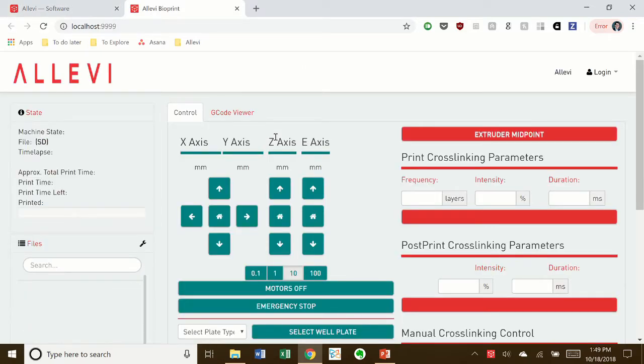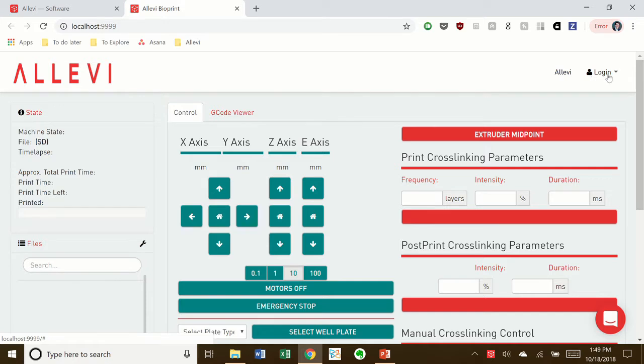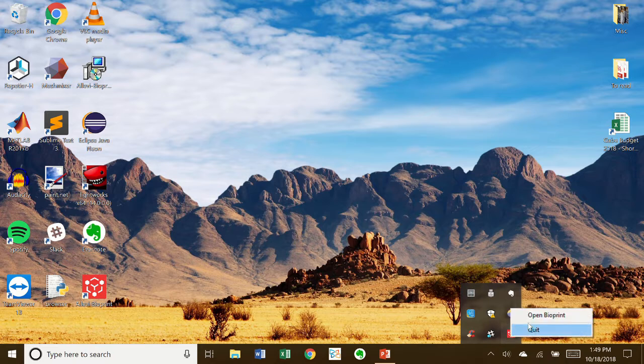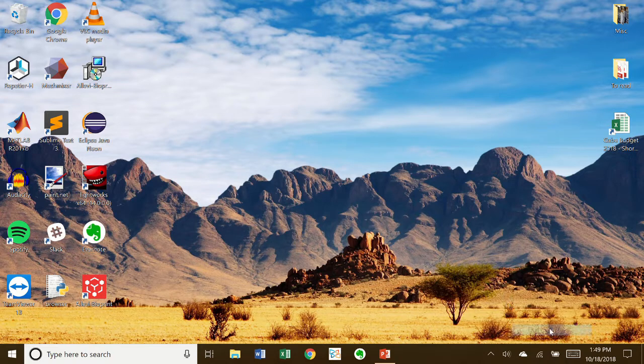Here, you can log in or connect to your printer. If you close the window, it will still run in the taskbar. Here you can open it back up or quit.